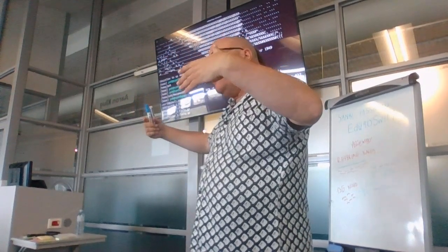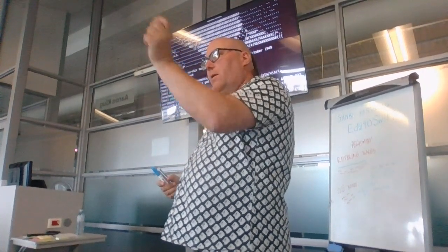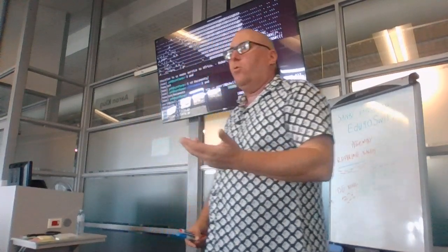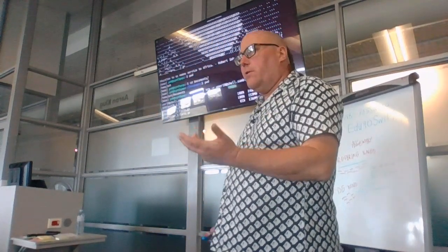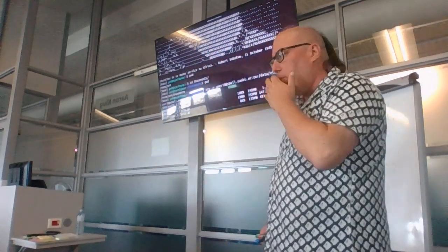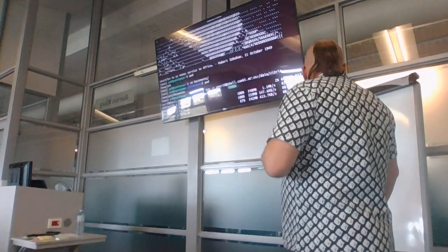So you can look for these loci, even though your assembly might not have produced a single contiguous piece of DNA for the whole of your genome. You can find these particular alleles within the different parts of your assembly, and you can get a profile using a service like PubMLST or Enterobase or similar, depending on which species you're looking at. These different databases have what we call cgMLST schemes.